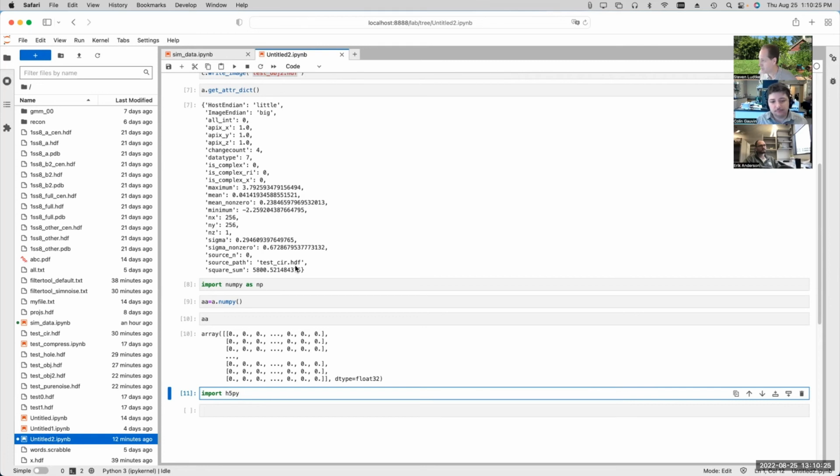I agree. It would probably make sense to be able to do that directly. We had our own motion correction software in EMAN for a while, but it just became kind of pointless to try and compete with MotionCor, which was focusing just on that motion correction step, and they were doing a pretty good job at it. So it didn't seem worth the effort to compete with that. Although I'll admit that it seems like there is further room for optimization in the motion correction arena again nowadays.